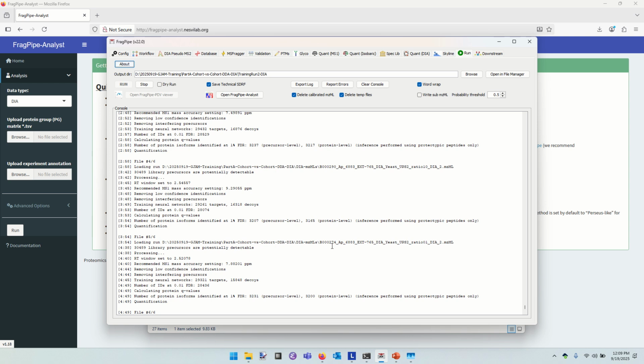Okay, and we're quantifying the last of the 6 files. Took 10 minutes extra. I'll have to be careful to make sure that this stays on time for the GJAM session, though. Yeah, I would do the TV kitchen thing of having a pre-baked one just in case. Yeah. And then I can add that to the image, no problem.